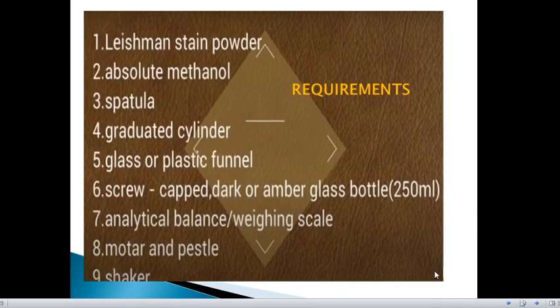The requirements for the preparation of this stain are: Leishman stain powder that you can get commercially, absolute methanol, spatula, graduated cylinder, glass or plastic funnel, screw-capped dark or amber glass bottle, analytical balance or weighing scale, and a mortar and pestle or shaker. We use dark or amber glass bottles to prevent contamination by sunlight, as exposure to sunlight will change the quality of the stain.